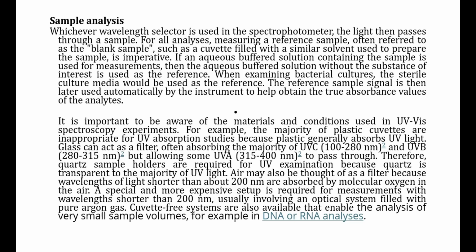And another is UVB rays. UVA, UVB, UVC are the types of components of UV rays. So 280 to 315 nanometers is UVB, but glass allows only UVA rays, 315 to 400 nanometers, to pass through. So glass also hinders transmission of the entire range of UV.